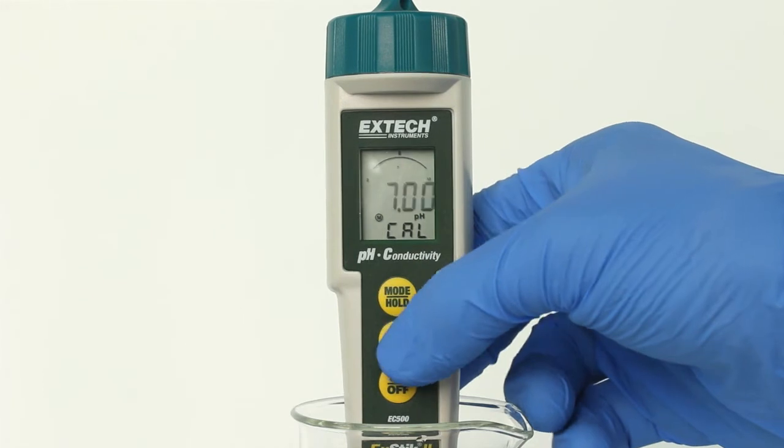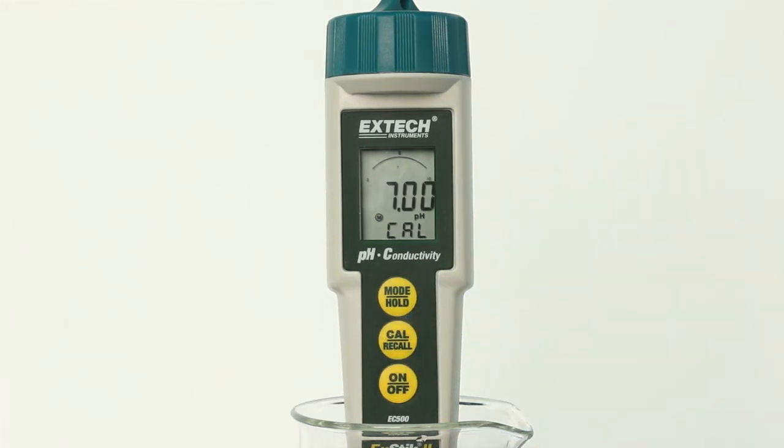Press and hold the CAL button until CAL appears in the lower display. When doing two- or three-point calibration, calibrate with pH 7 buffer first, then follow with pH 4, then pH 10 buffer. The meter will automatically recognize the solution and calibrate itself to that value. The pH reading flashes on the main display during calibration. When calibration is complete, the X-TIC automatically displays SA, then END, and returns to normal operation mode.